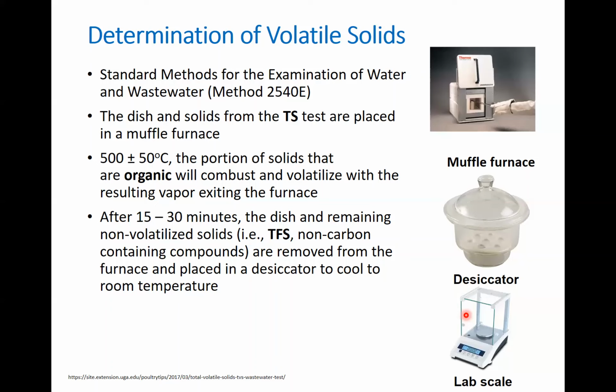Basically, volatilized means that all of these organics are gone during this kind of combustion. The leftovers after this give you the ash, or the total fixed solid. So basically, this is the non-carbon part contained in the material that is being tested.